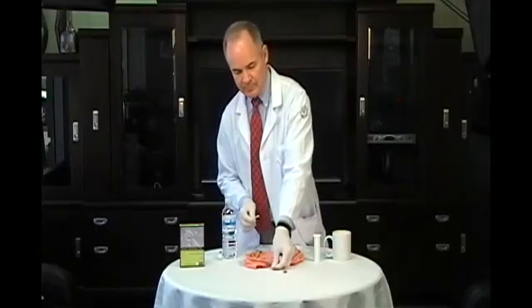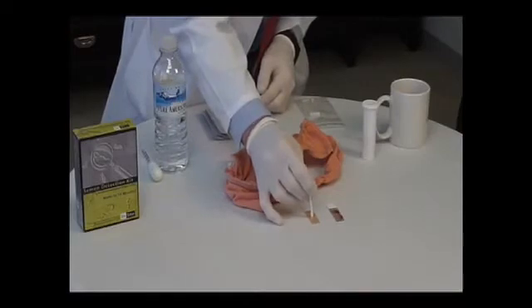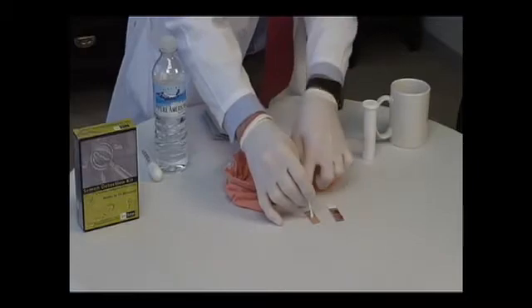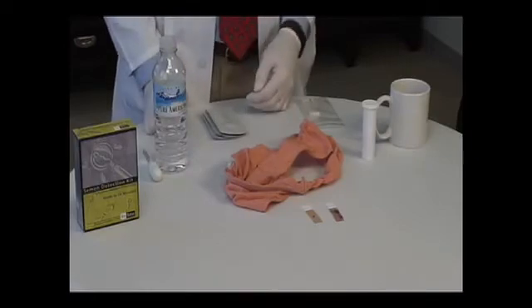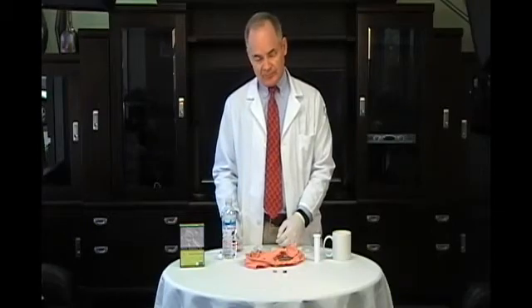Now, place the Q-tip on the test strip for 10 seconds. 1,000 1, 1,000 2, 1,000 3, up to 10. That's a positive test. This gives a little bit better defined spot than placing the strip directly on the underwear, but the technique is up to you.